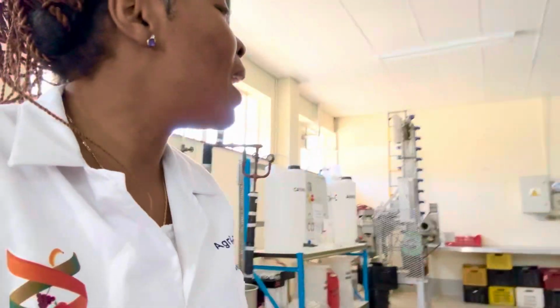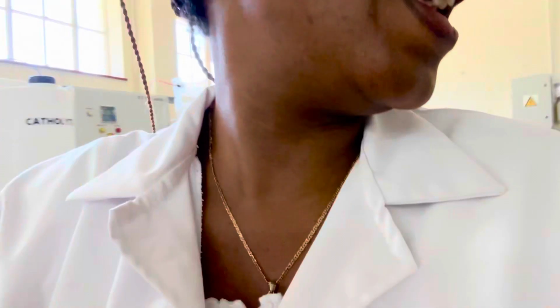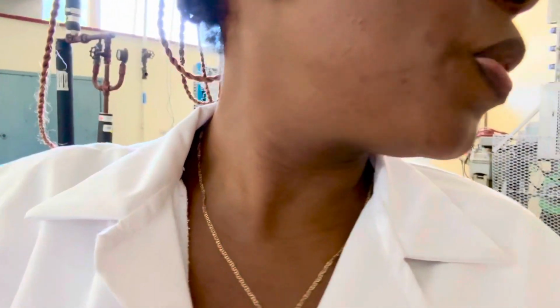This is peach. See, I'm showing my people what is peach. For those who don't know, yeah, so this is the peach. But this is from South Africa, right? Is it a South African cultivar? Yeah, so the ARC, the Agricultural Research Council cultivar.